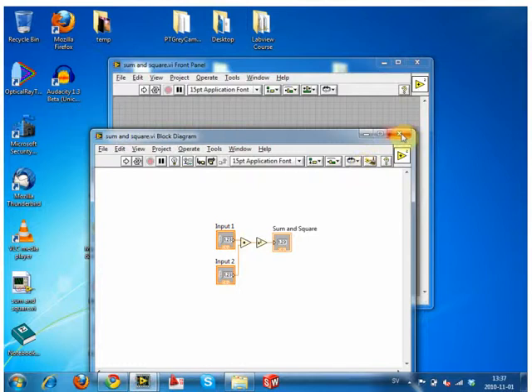I'm not sure how you save just these things. You saved what you did before. Just go to File, Save. We want to write it as a VI. So just click on the desktop or something. So we've got a little file somewhere now.